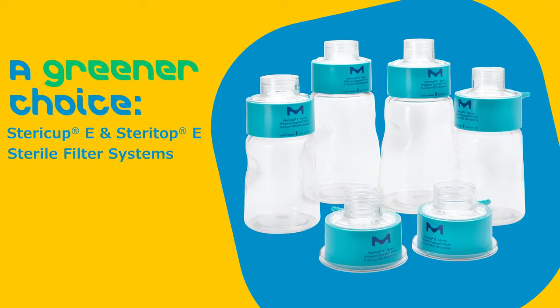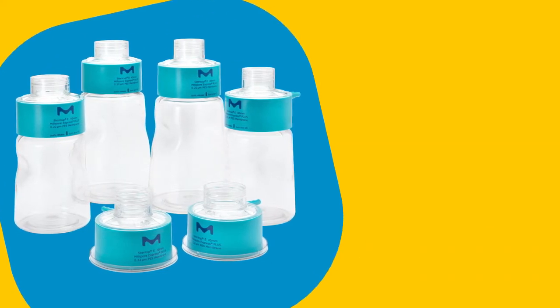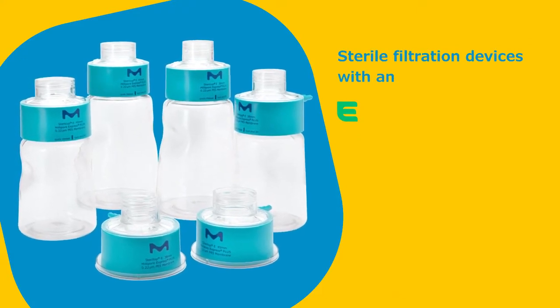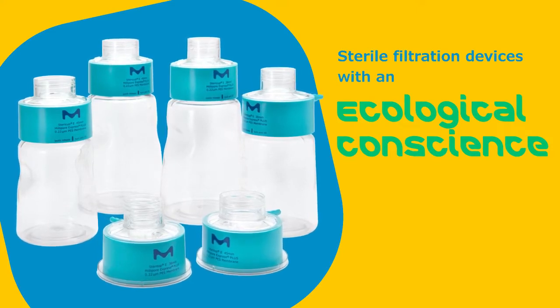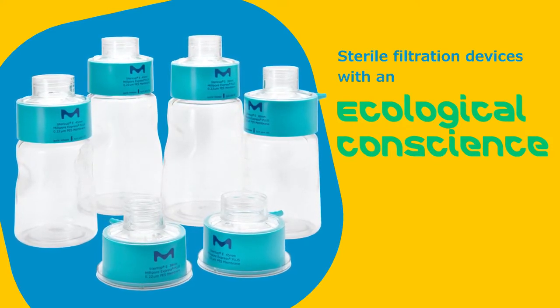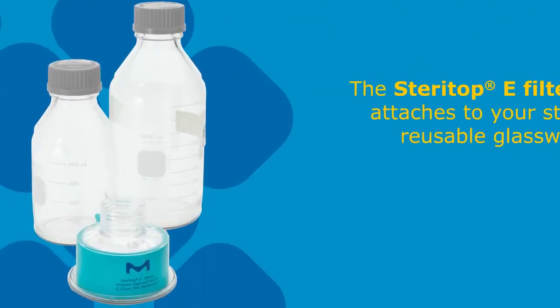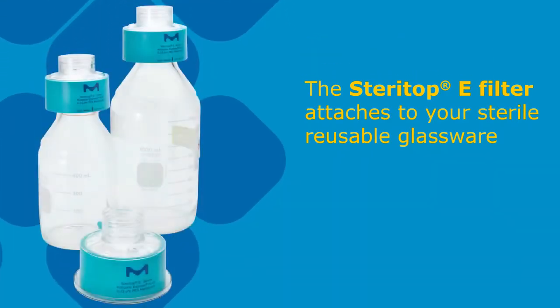SteriCup E and SteriTop E devices significantly reduce waste associated with traditional sterile filtration. By eliminating the need for the plastic receiver funnel, the SteriCup E filters help to reduce the use of disposable plastic, and the smaller product results in a reduction in the amount of packaging materials, which means less storage space needed in your lab. The SteriTop E filter attaches to your sterile, reusable glassware for an even more dramatic reduction in disposable plastic and packaging.